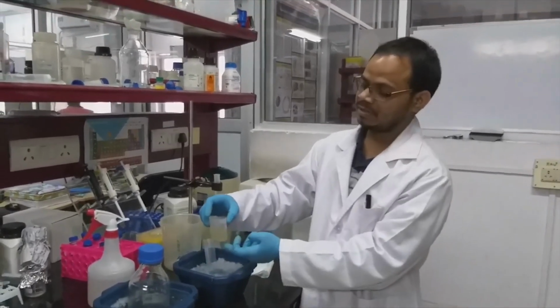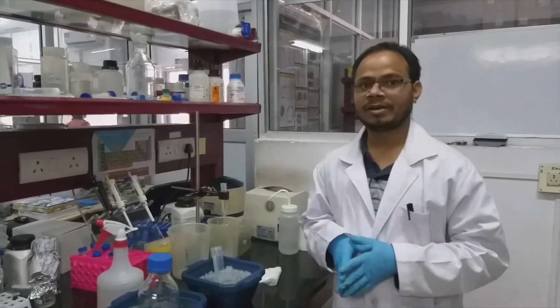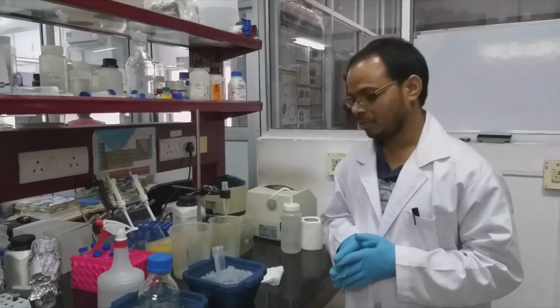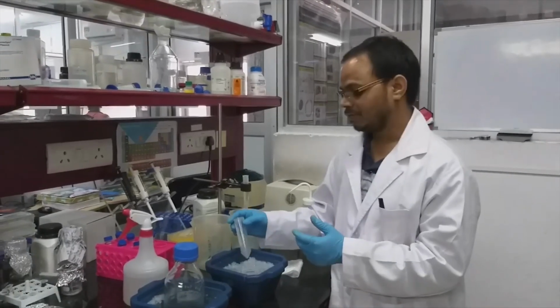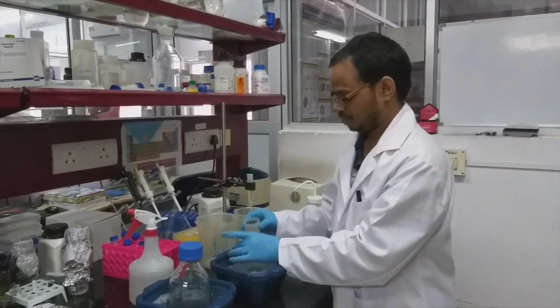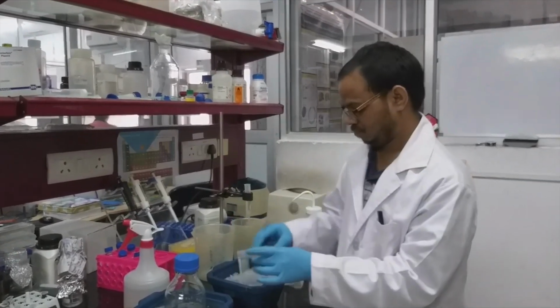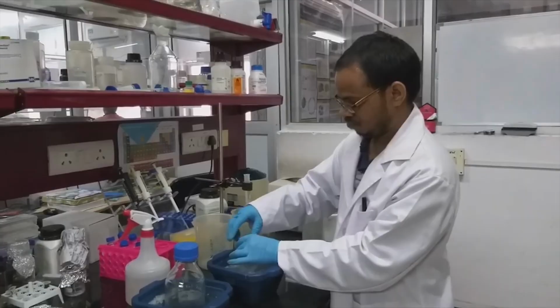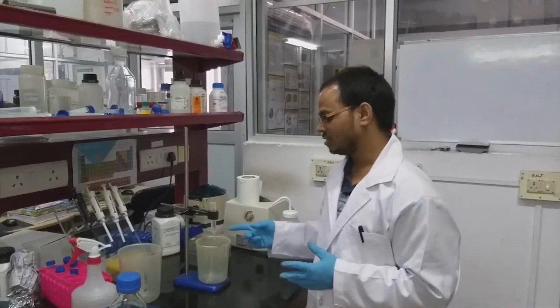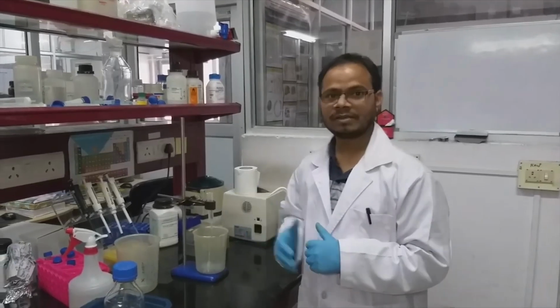We have lysed the cells using sonication. Now we have to centrifuge the lysate to get the supernatant. That supernatant we load onto the nickel NTA column to purify the protein. So I will transfer it into a 50 ml centrifuge tube, then I will centrifuge. While the centrifugation is going on, we have to wash the column, which is in 20% ethanol.